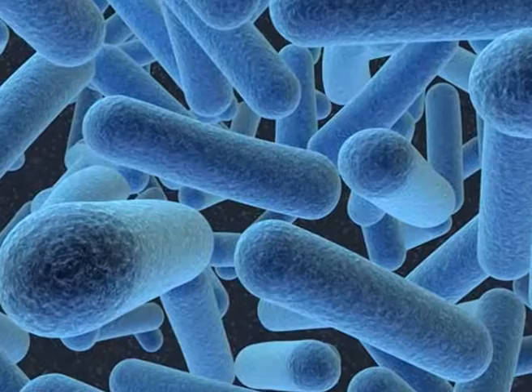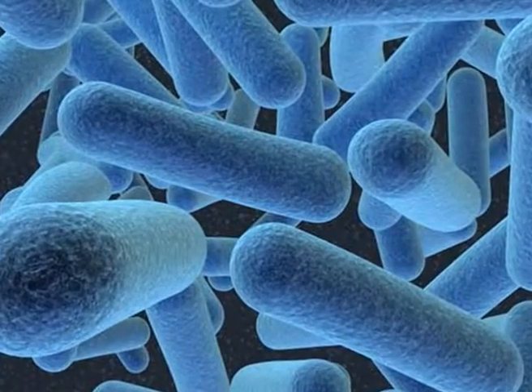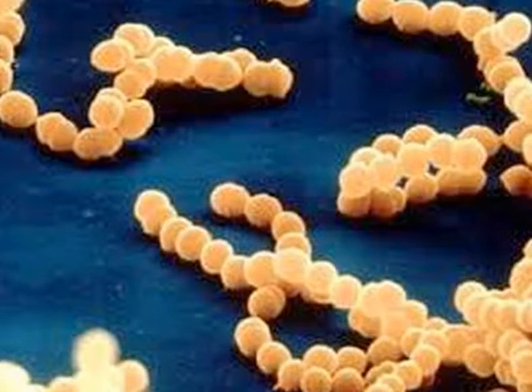It is not only the nutritional status or the composition of culture medium which plays an important role. The growth of bacteria under lab conditions or in any kind of conditions depends upon the physical environment also. For example, if we want to grow aerobic bacteria, then we need to keep them in an oxygen-rich atmosphere. Similarly, if we want to grow anaerobic bacteria, we need to keep them in an oxygen-free atmosphere.